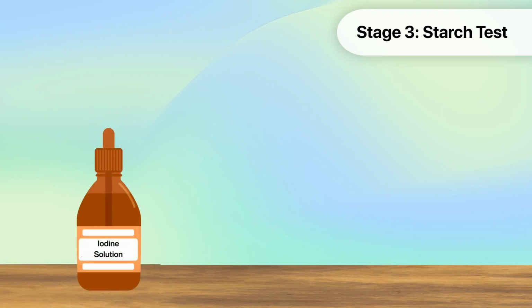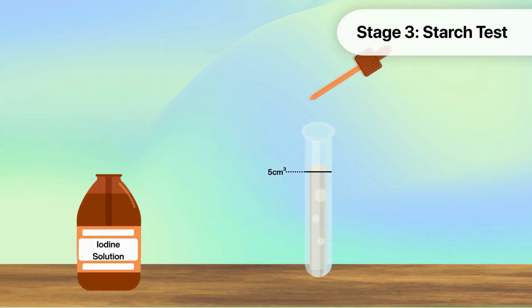Let's move on to our next test. This time, we will be using iodine solution to test for the presence of starch. Start by transferring 5 centimetres cubed of the food sample into a new test tube. Then, add a few drops of iodine solution. Next, gently shake the test tube.